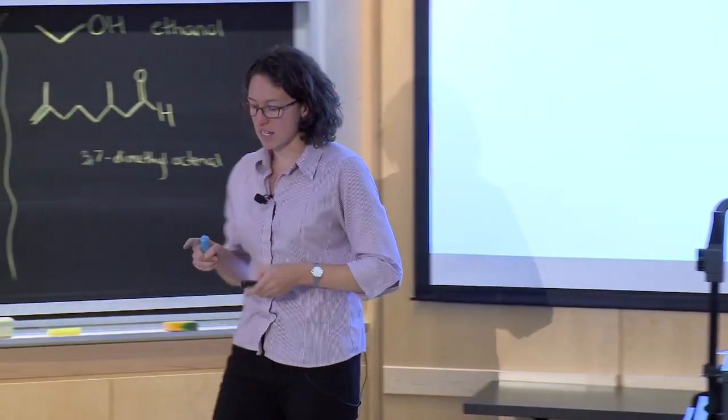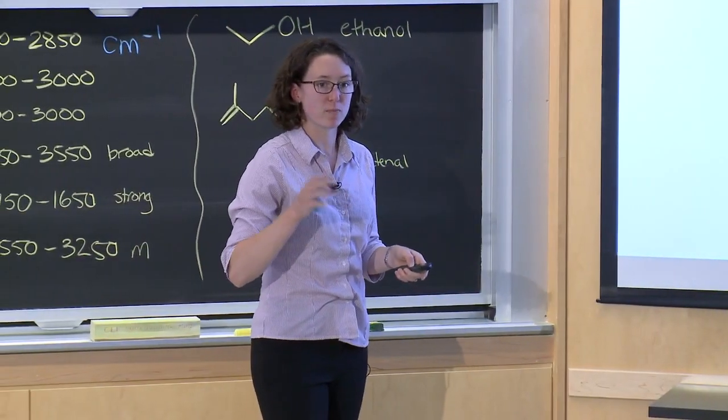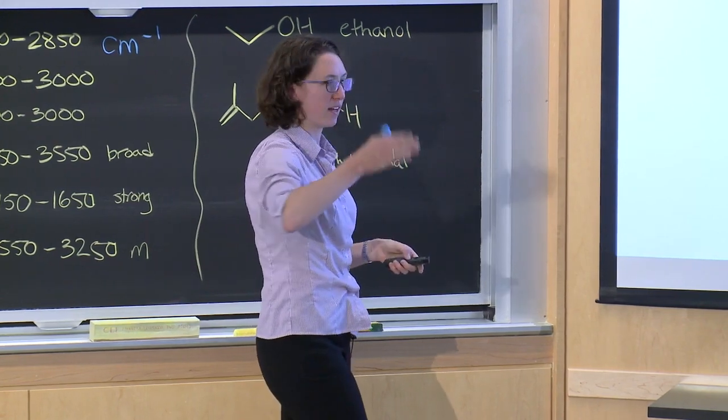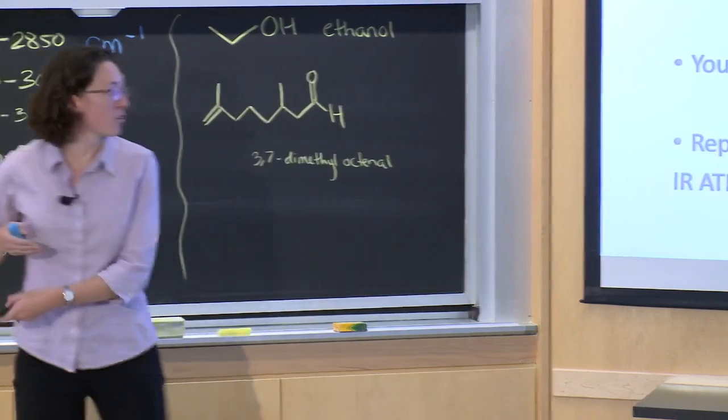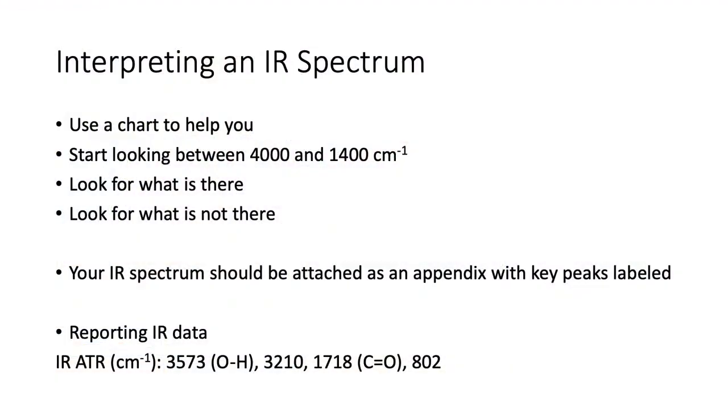And the instrument will print that out for you on your spectrum, so you'll know what the highest intensity is for your peak. So you can report the highest intensity wave numbers for each of your peaks, and if you know what the peak is, in some cases people will put what bond it represents. You don't have to. It was acceptable to do it both ways according to the ACS style guide, so that's kind of up to you. It's a little more helpful for the person reading it, but.